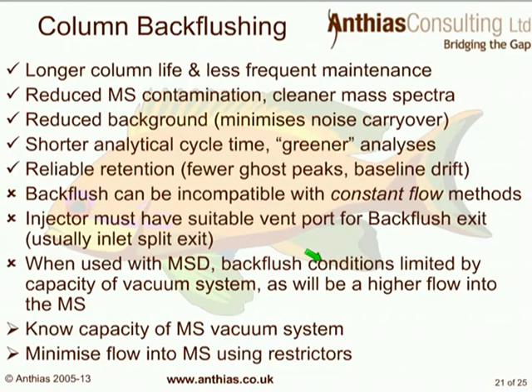It will give us a shorter analytical cycle time because we only have to analyse up to the point where the last compound of interest enters the mass spectrometer, and then we stop the run and enter backflushing mode, which is much faster. We can get good reliable retention. We get fewer ghost peaks and baseline drift. That's because we're removing all that heavy and involatile material from our stationary phase.